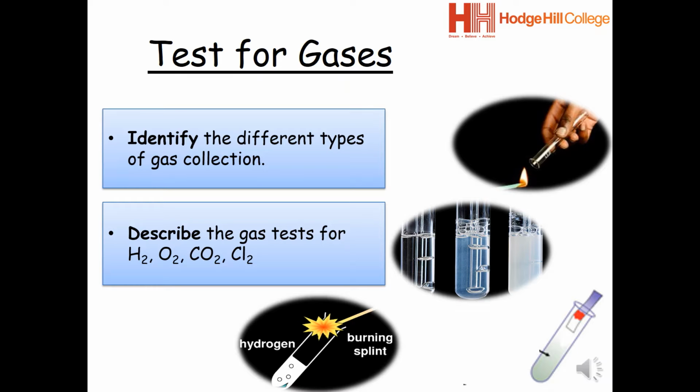In this video, we'll be looking at the test for some common gases. By the end, you should be able to identify the different types of gas collection, and you should be able to describe the gas tests for hydrogen, oxygen, carbon dioxide, and chlorine gas.